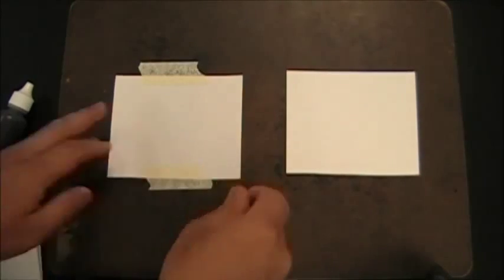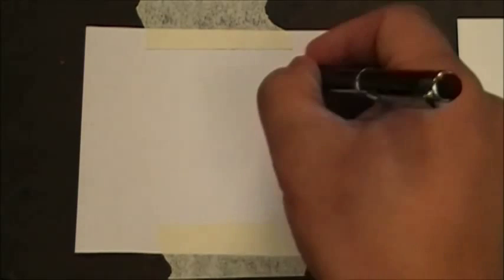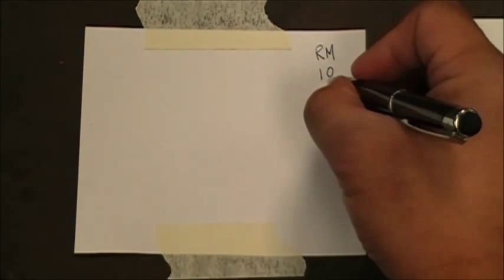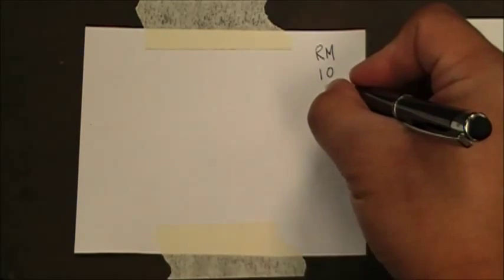To begin this lab, flip over your whiteboard. Take two index cards and tape them side by side. Next, label your index cards with your initials, your table number, and the angle at which you will be performing the blood drop activity.